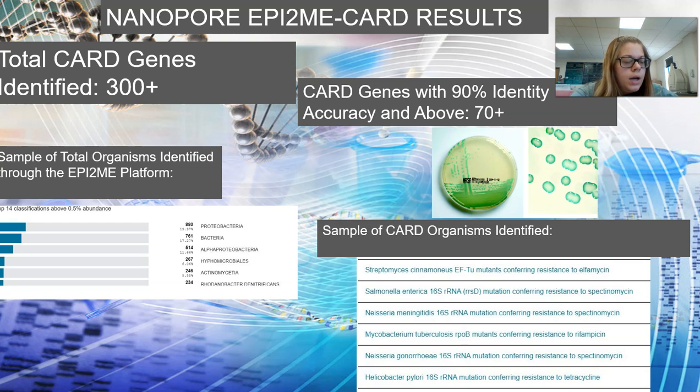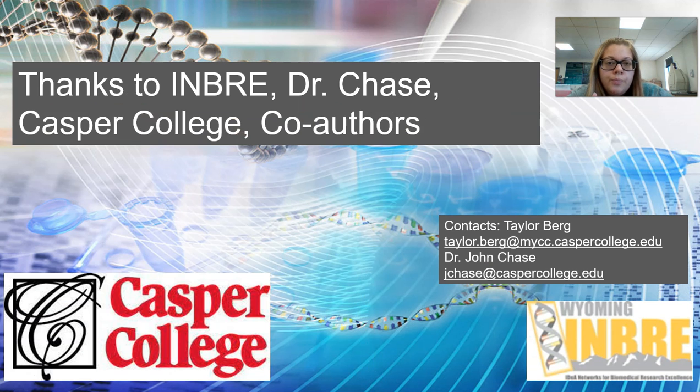And so in the end, we did prove that the MinION sequencer can work in identifying antibiotic-resistant genes and reservoirs around the community and in the environment. And we can use this information. It could be used in a clinical setting.